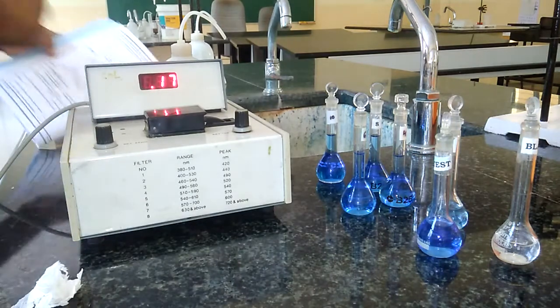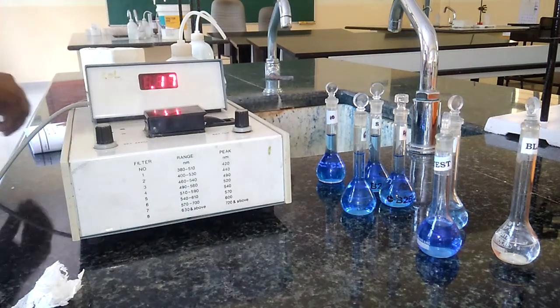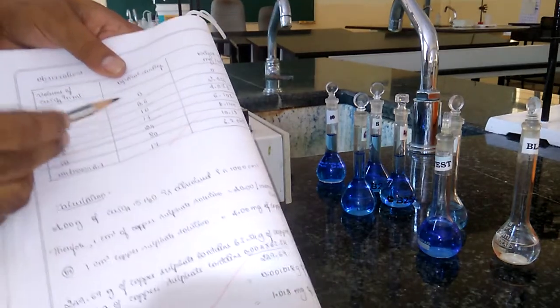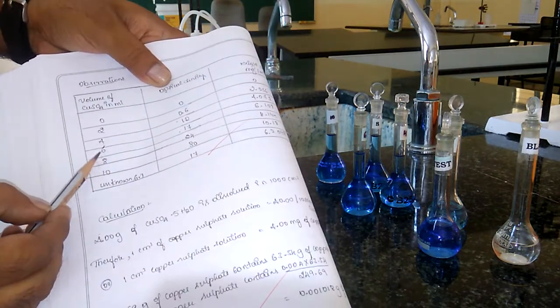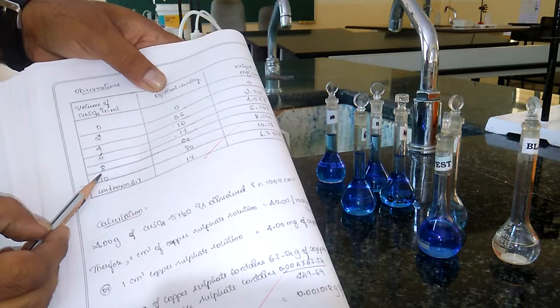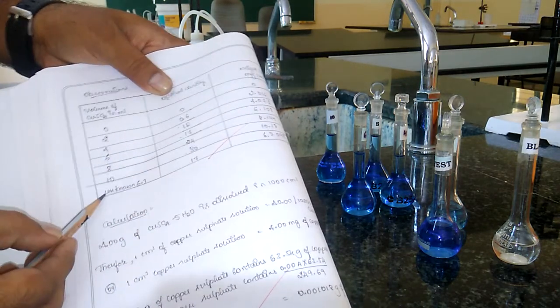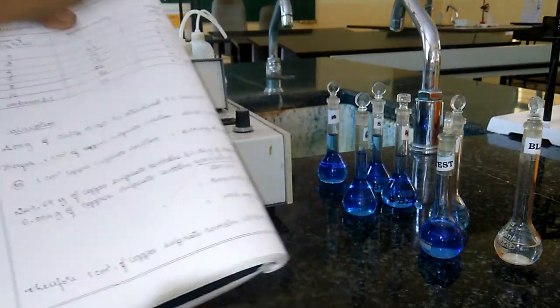This is a record from a previous run. Some values are shown here: for 2 ml, it is 0.06; for 4 ml, 0.10; for 6 ml, 0.17; for 8 ml, 0.24; for 10 ml, 0.30. For the unknown solution, it is showing 0.17, which is the same as our current reading.